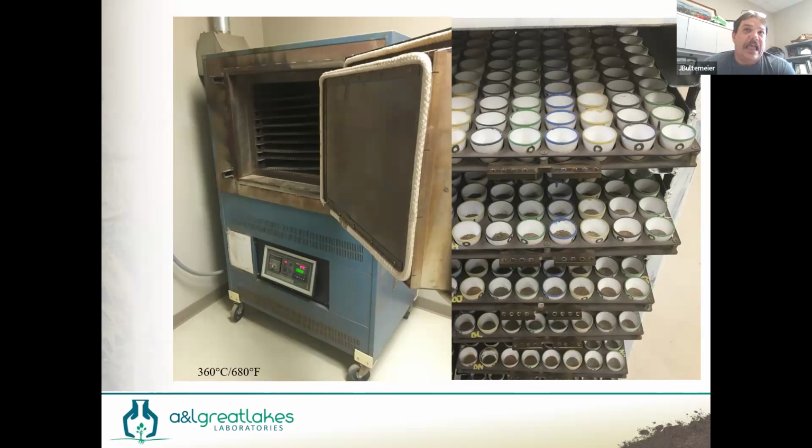We'll take that sample after a prescribed burn, cool it back off, and we'll weigh the sample again. The difference in weight is the percent of organic matter by weight. We call it loss on ignition. The temperature may vary with some of the analytes. Compost will run at some higher temperatures from time to time or lower depending on the method, but the same basic concept is done to determine organic matter.